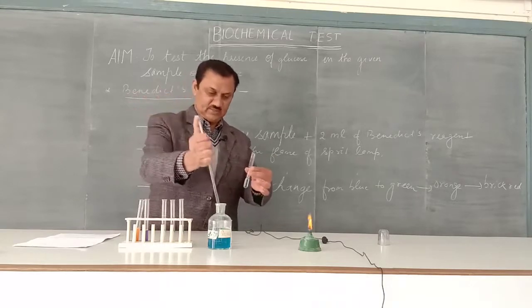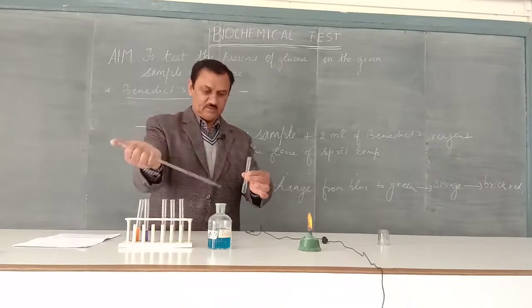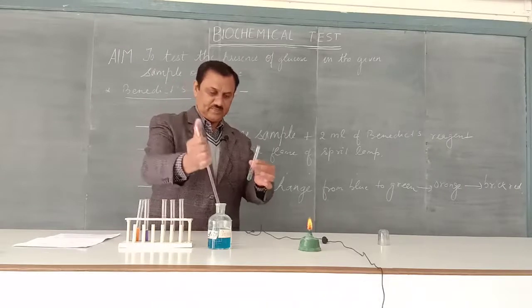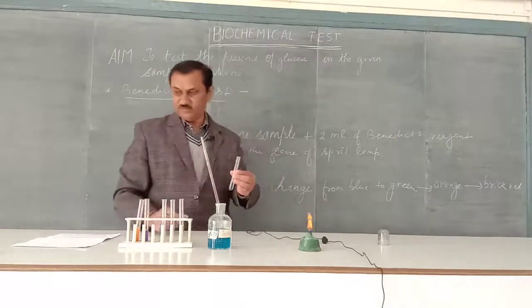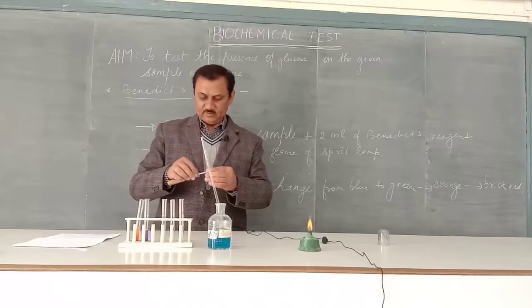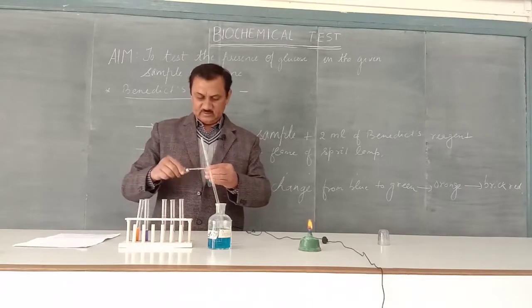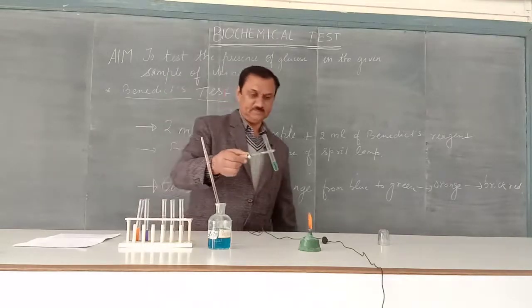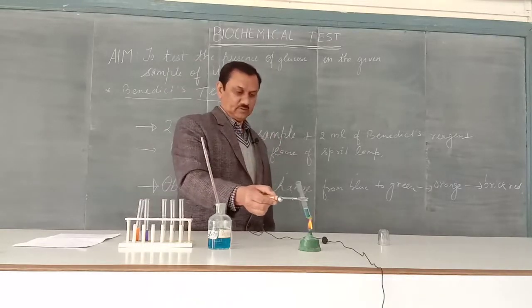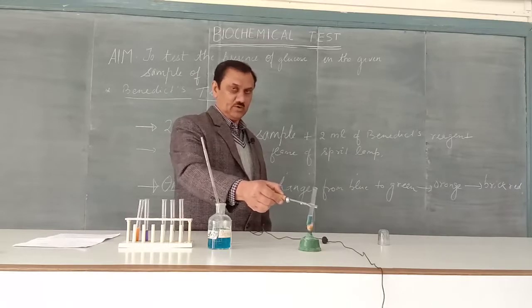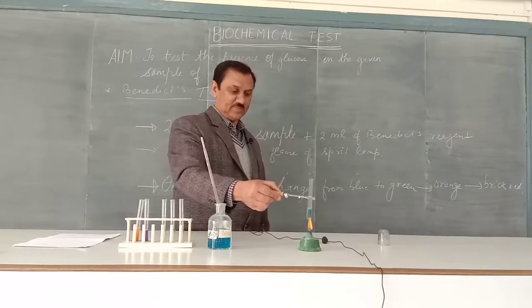After adding this reagent, boil the solution by keeping the test tube on the flame of the spirit lamp. We must use a test tube holder. The mouth of the test tube should be kept away from the body to prevent any mishap.